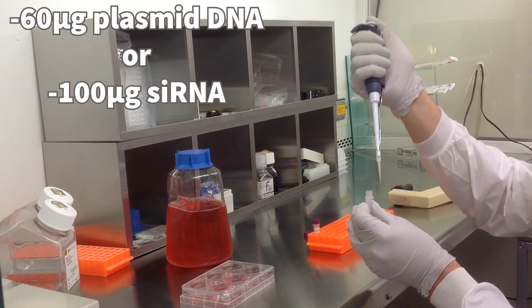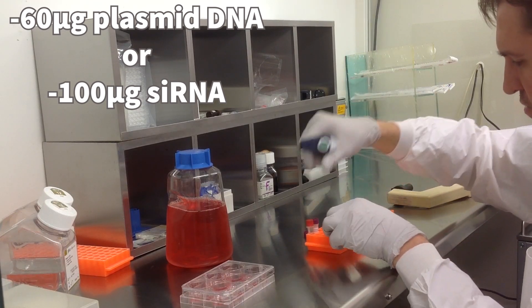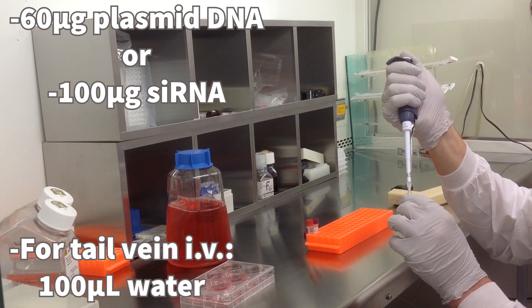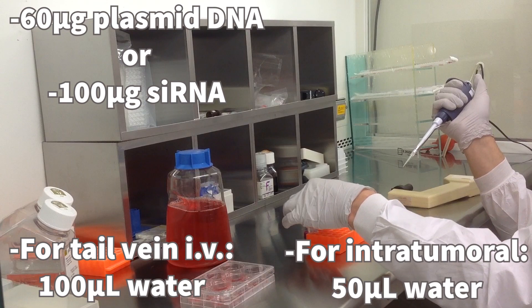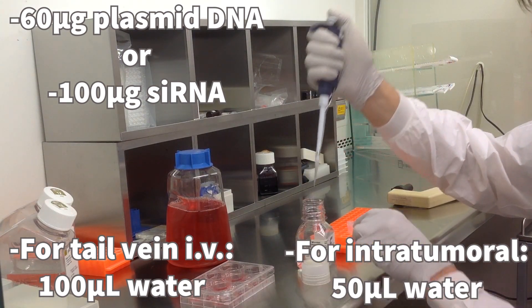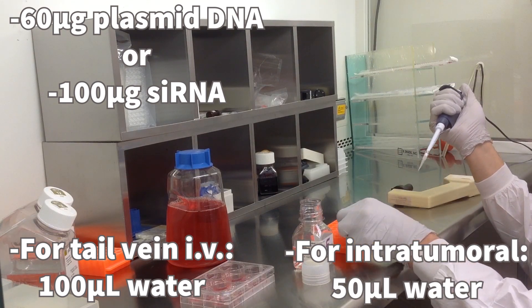Start by diluting 60 micrograms of plasmid DNA or 100 micrograms of siRNA into either 100 microliters of water for tail vein IV, or 50 microliters of water for intratumoral IT administration. All water used is DNA/RNA-free molecular biology grade water.